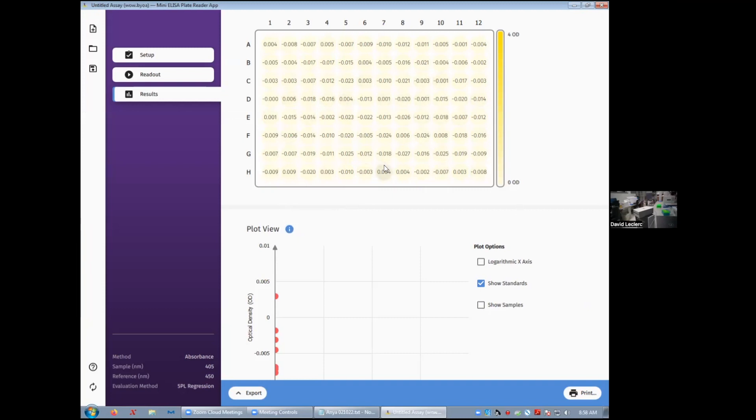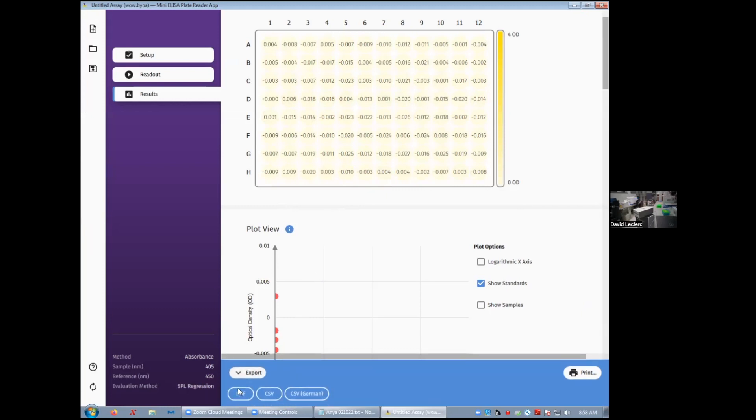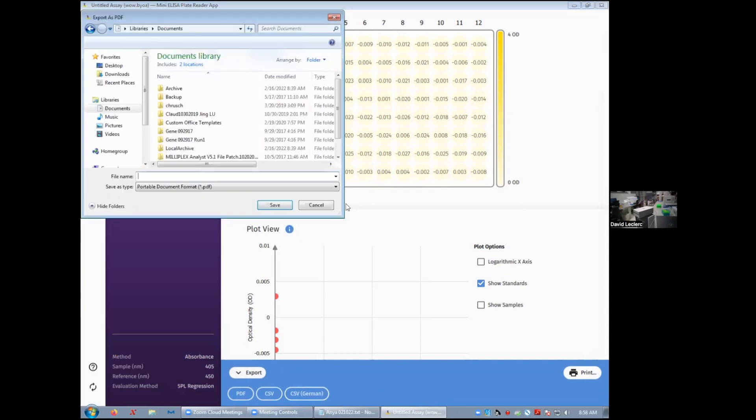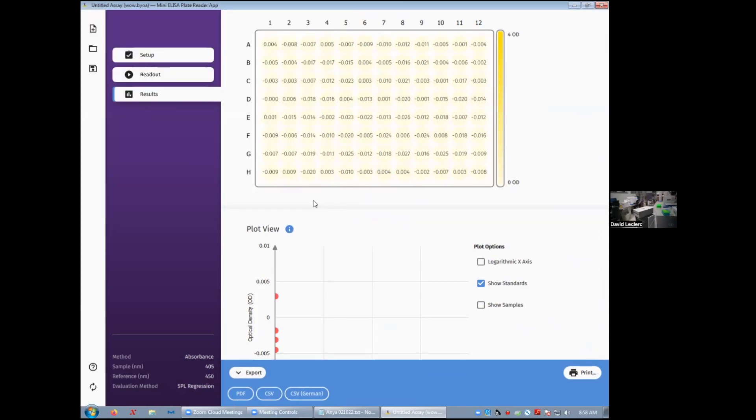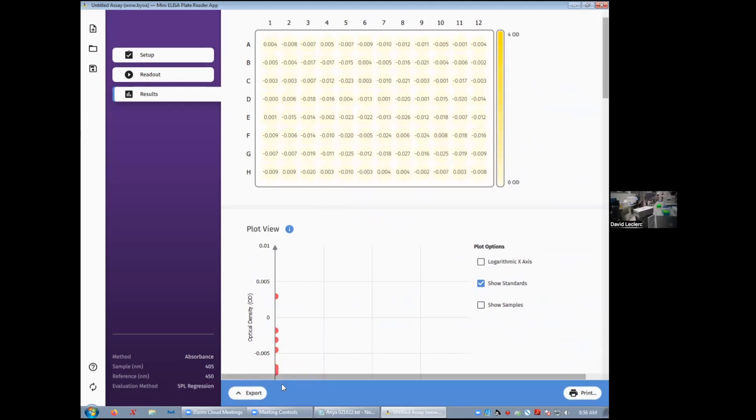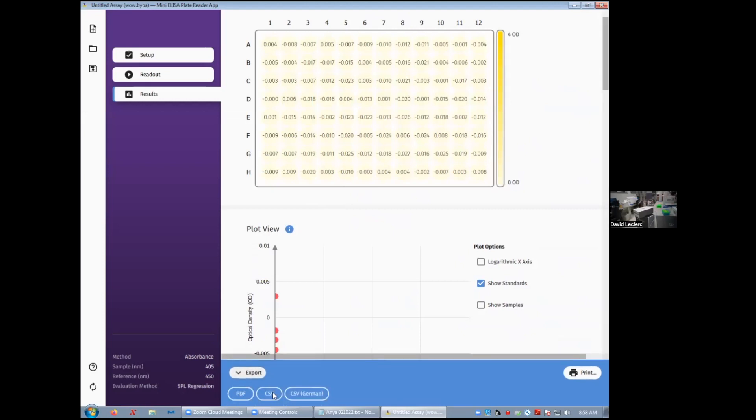If you want to use a different export method, you can go to export at the bottom and you can save your data as a PDF or as a CSV or as something called CSV in German, which I don't know what it is. So we'll stick to a CSV.